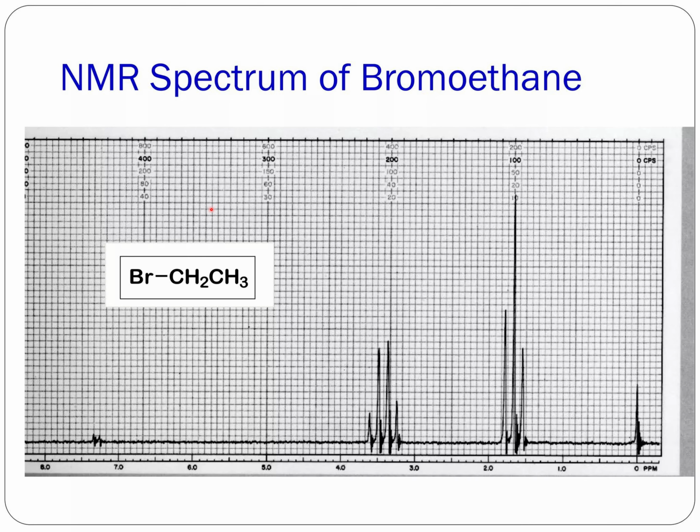The NMR spectrum of bromoethane has been shown here. This is for TMS, you can see a peak at 0. Then near the bromine, here is one, here is another one. Think that is B, that is A. A would be here and B would be here because of electronegativity, so their positions have been defined. Now for A, its height would be higher because it contains 3 hydrogens, and B's height would be lower because B contains 2 hydrogens.